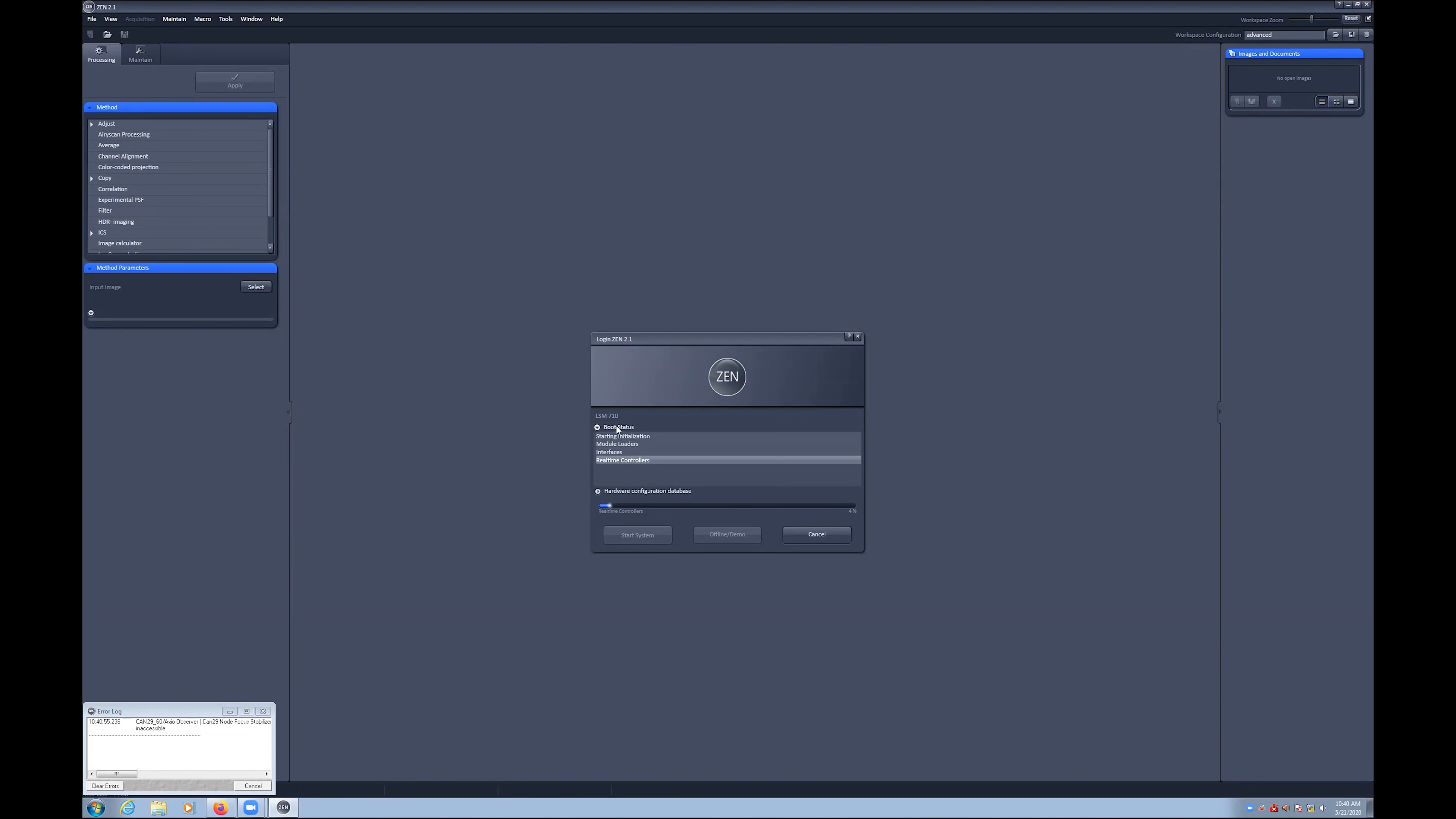If you have a stream of errors appear in the new window in the bottom left, you may need to exit the software, turn off the third switch for the real-time controller, wait a few seconds, turn it back on, ensure the connection is stabilized in the network icon, and then restart the software. If you continue to see a lot of errors at startup, a full system restart may be required. This involves turning everything off, including the PC, and starting again. If you still have issues after a full restart, contact facility staff for assistance.